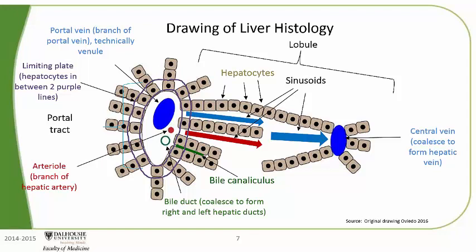The last thing we are going to label is the Kupffer cell. The Kupffer cell is a type of macrophage which resides in the sinusoids. I think of macrophages as part of a clean-up crew, since their job is to eat debris. The Kupffer cell's job in the liver is to remove damaged red blood cells, bacteria, or debris from the sinusoids.